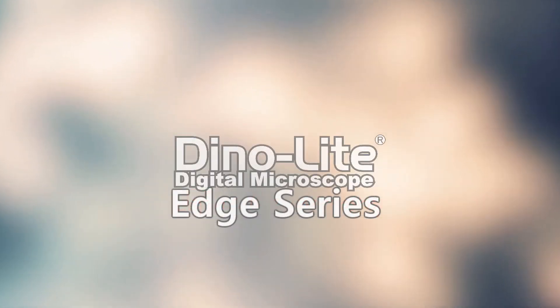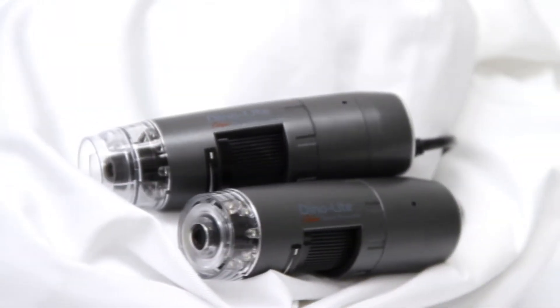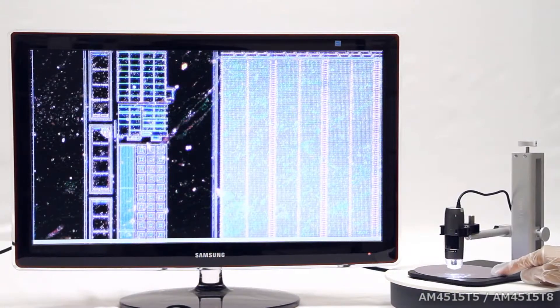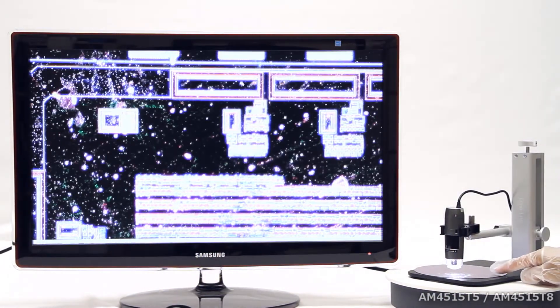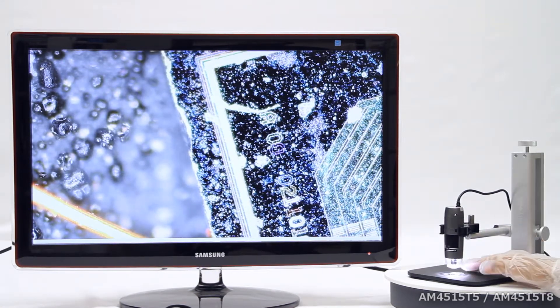Introducing the Dynalight Edge Series 4515 T5 and AM4515 T8. Both of these models feature the Edge Series sensor with improved sharpness, color, and image quality.